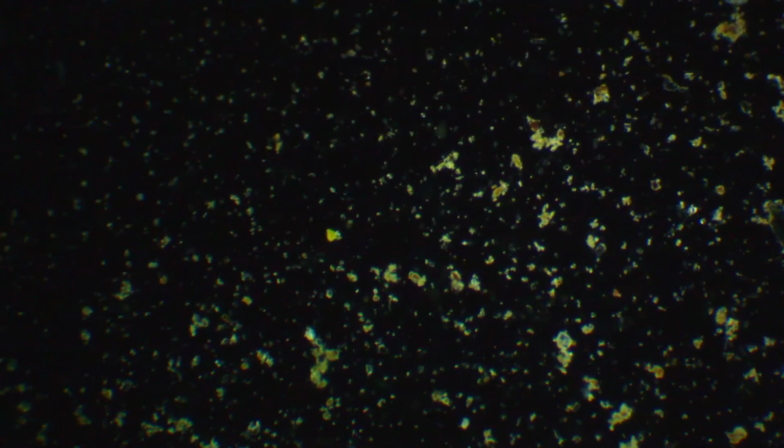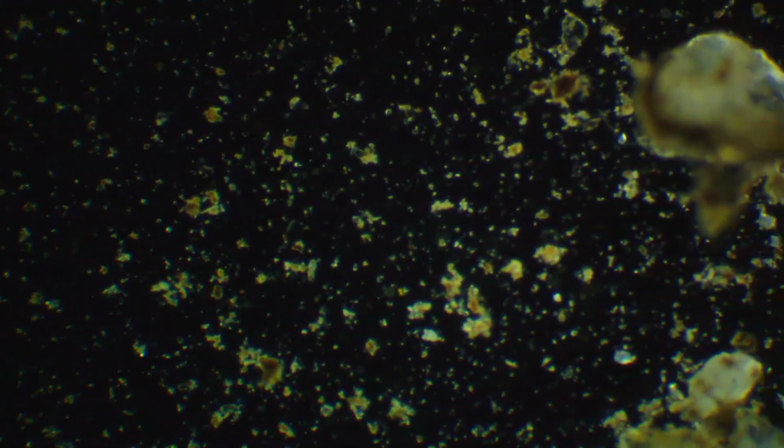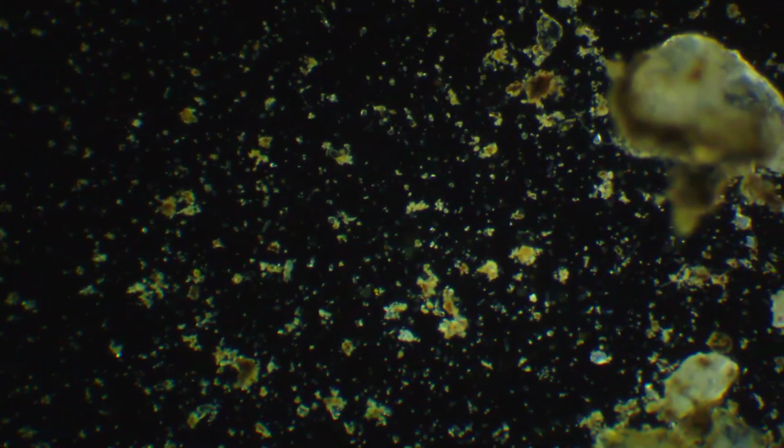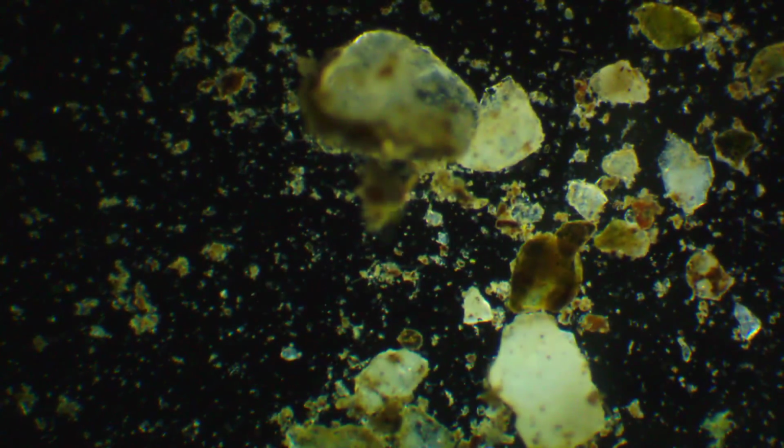Looks like a few little parameciums swimming around. Looks like another detached worm or another paramecium. I can't tell. Yeah, those guys. I swear, you guys are a little bit crazy. You're a little bit loopy in the head, you know?